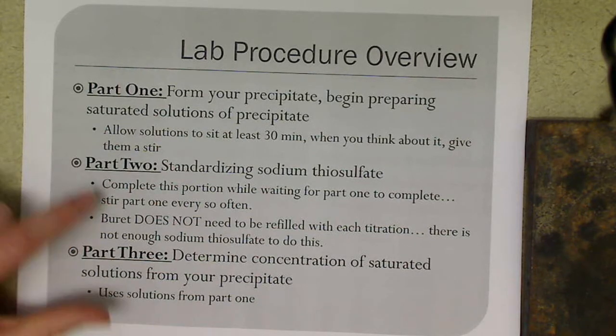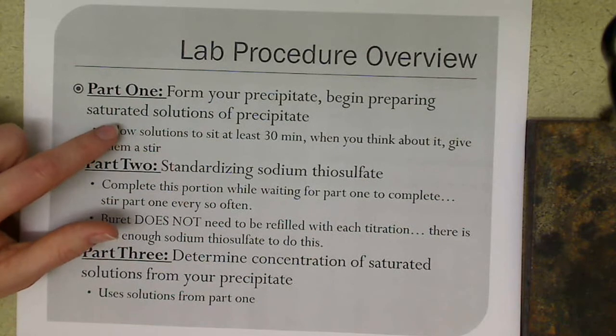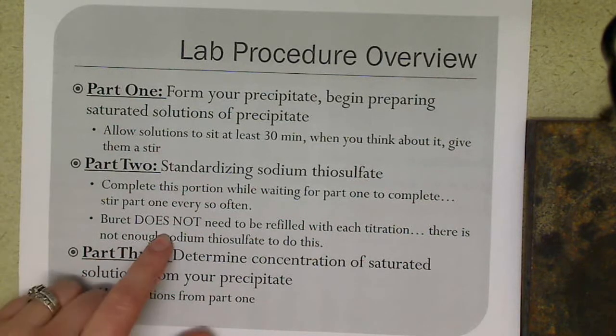While you're doing part 2, make sure that you're stirring these solutions from part 1 and make sure that there's always solid in there so that we can form a saturated solution. If there's not enough solid in there, then you don't have a saturated solution.